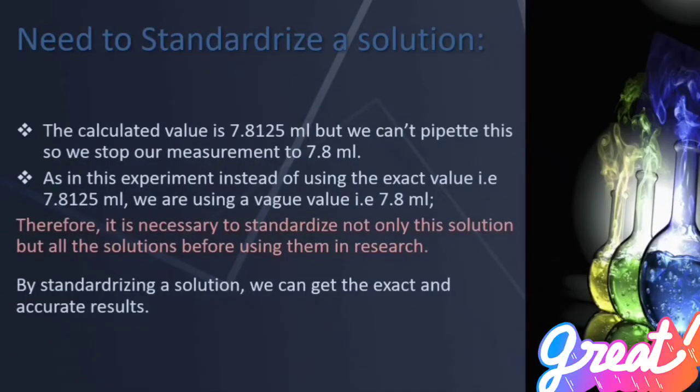So how to standardize a solution? As you can see, the text boxes in the captions are given in the presentation video. What is the need to standardize a solution? The calculated value is 7.8125 ml, but we can't measure this, so we stop our measurement at 7.8 ml.